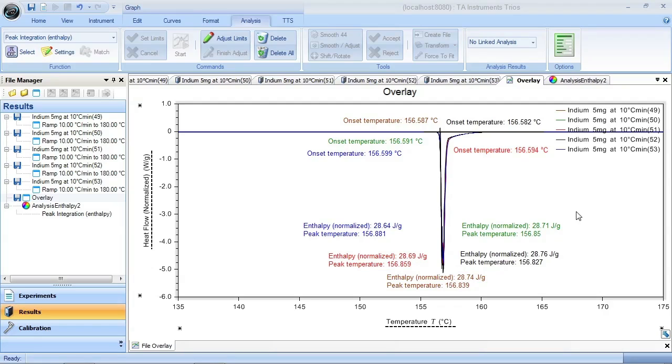I have here an overlay plot in the peak integration analysis results for a set of five indium repeatability measurements. At this point, the results are merely labels on the plot, but we can do so much more with them if we wish to.